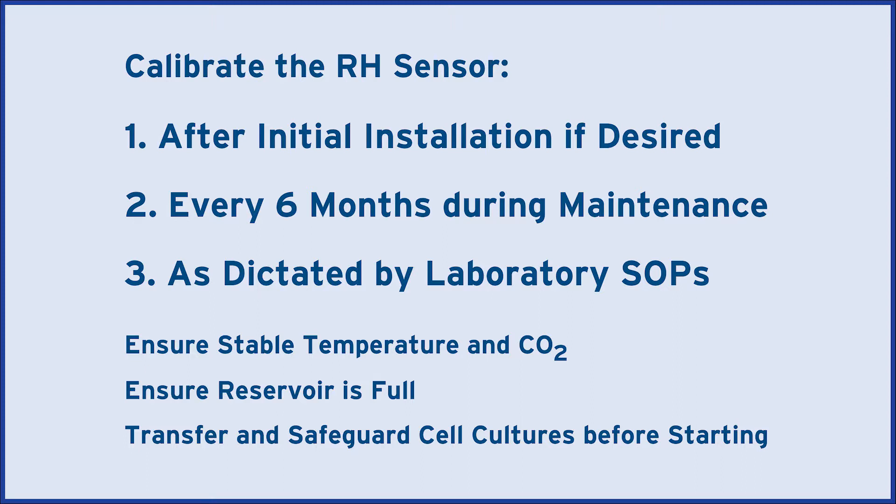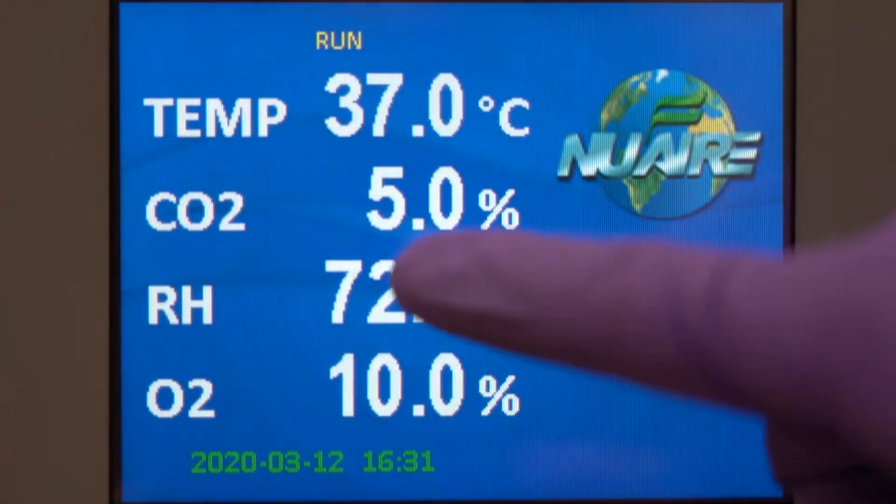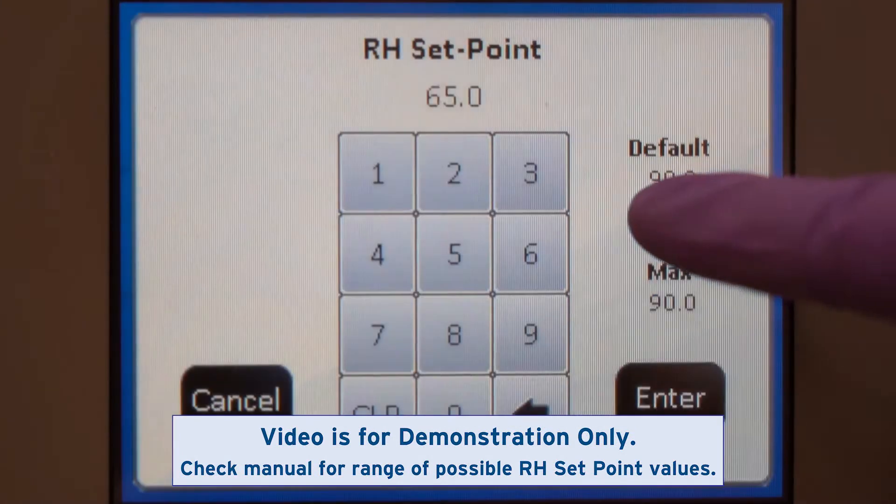Ensure chamber temperature and CO2 are stable and the water reservoir is full. Transfer and safeguard any cell cultures before starting. Set the actively controlled RH setpoint to the desired value.